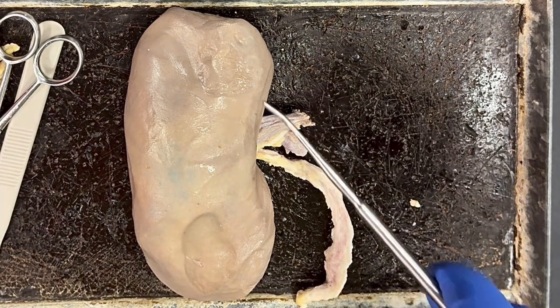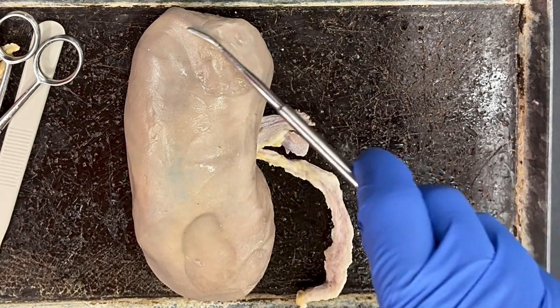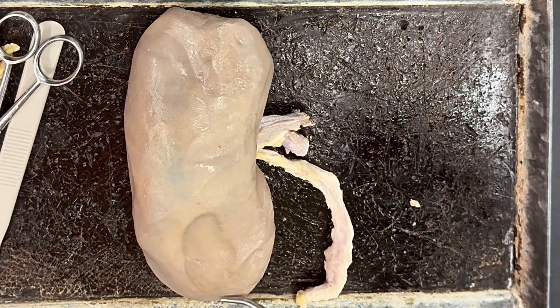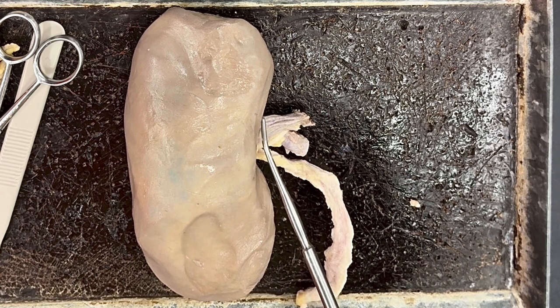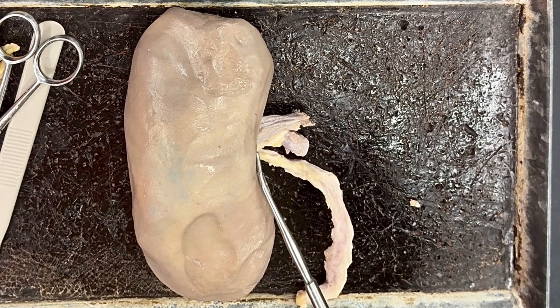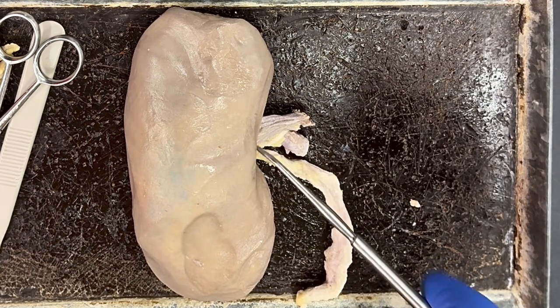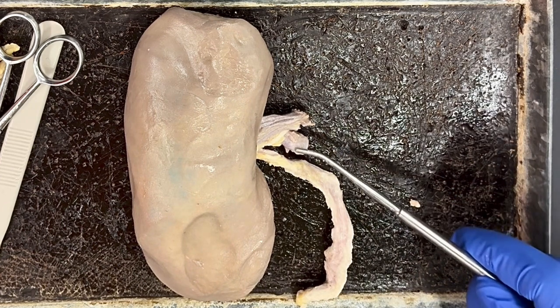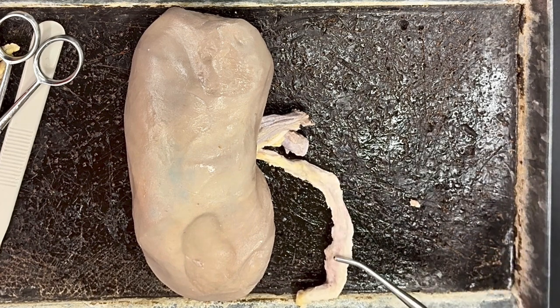The kidney is going to have an outer capsule known as the fibrous capsule. That's what we are seeing here. And then there's this indentation in the kidney, and that is known as the hilum. Once we find the hilum, that's going to help us find our renal vein, our renal artery, and then here we can see our ureter.